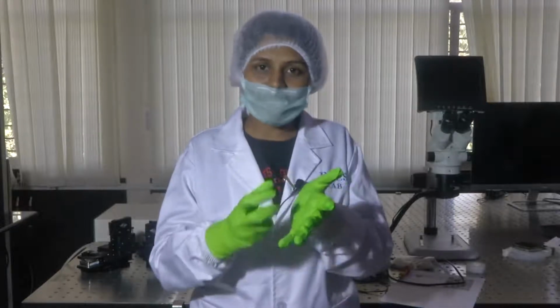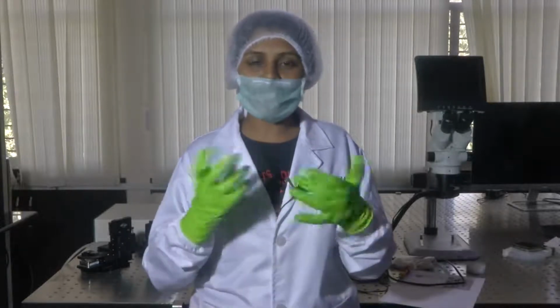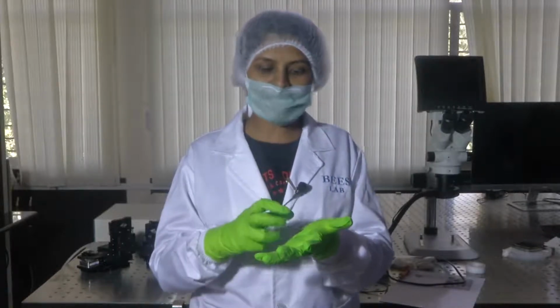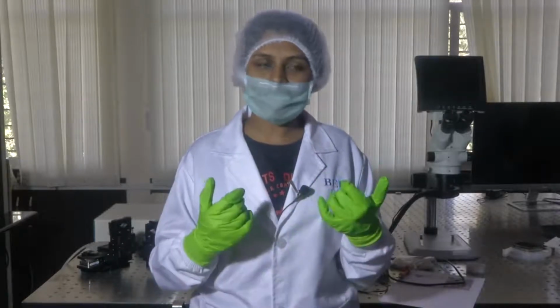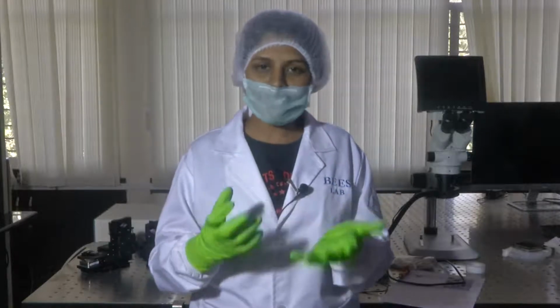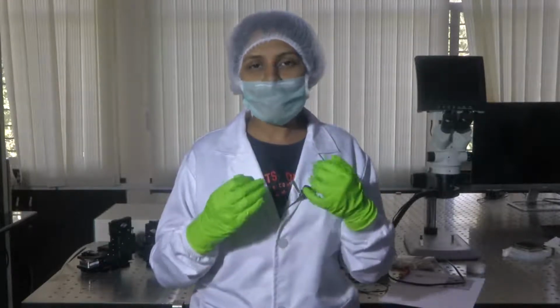So, how do you get this precision? And that is when we use the micromanipulator. Now that you have understood how and why the micromanipulator plays a major role, let us see how to use the manipulator and study how they can be leveraged to understand the mechanical properties of tissues, or they have been used to study single cell manipulation. So, they have a broad range of applications.